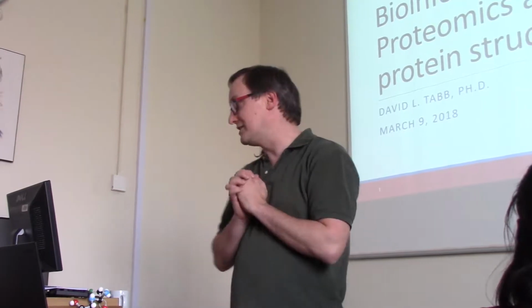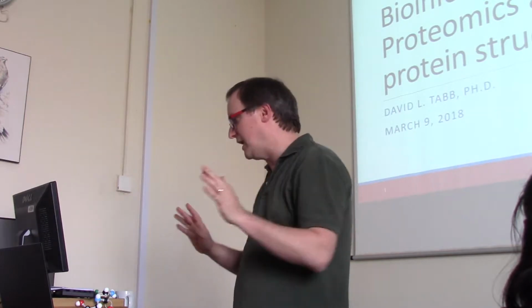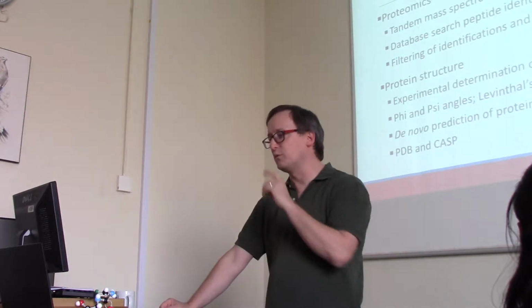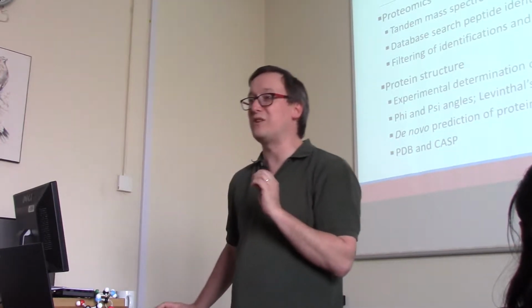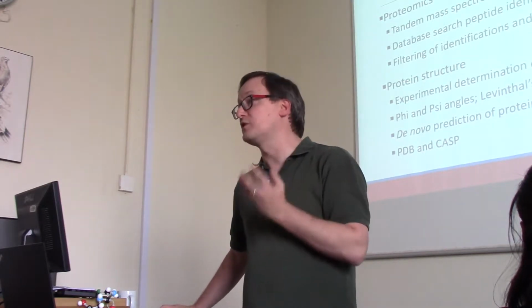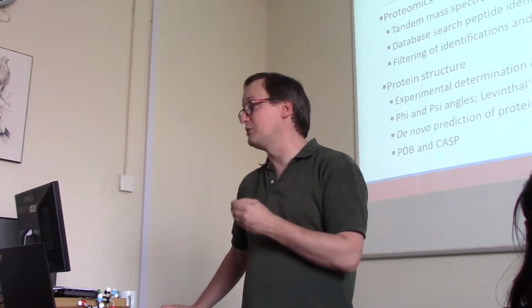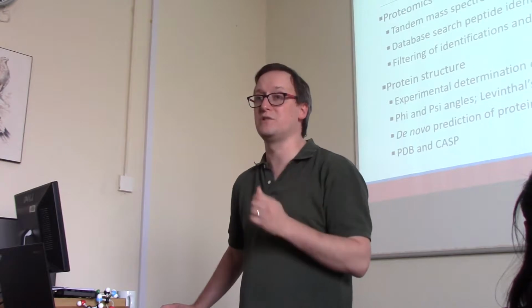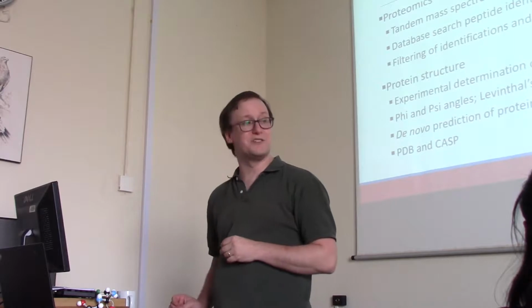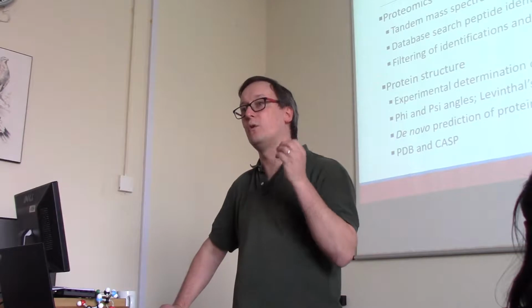So with that said, let's dive into the fine world of proteomics, or as I think of it, protein identification, and protein structure, the other part of this. Now, let's move ahead. And so we're going to be spending a lot of time talking about tandem mass spectrometry. Stellenbosch University is one of a few universities within South Africa that have invested significant money in mass spectrometry instrumentation that allows us to identify proteins. So these are tandem mass spectrometers. We will talk a little bit about how these instruments work, because after all, if you don't understand where the data come from, you probably won't understand what you can do with them.